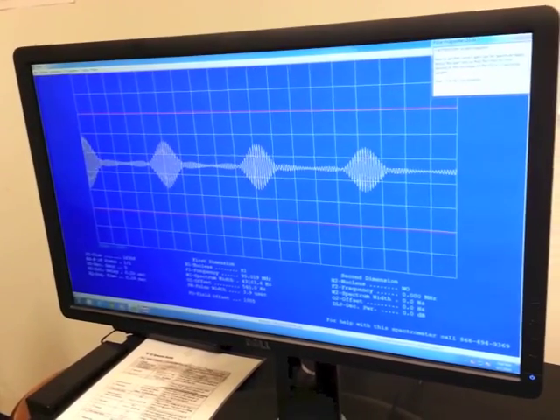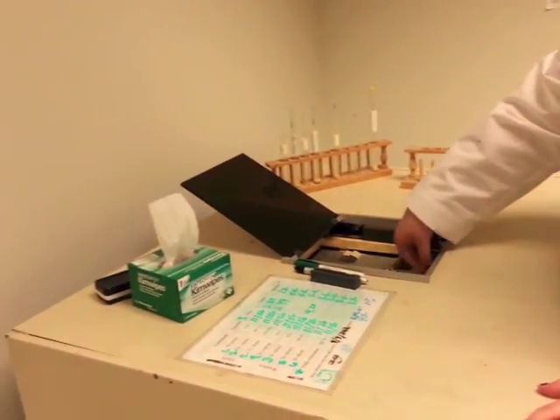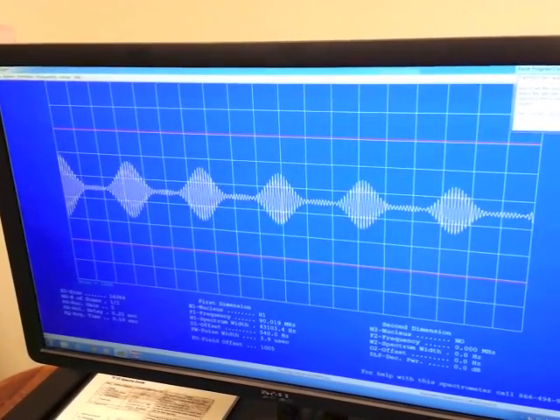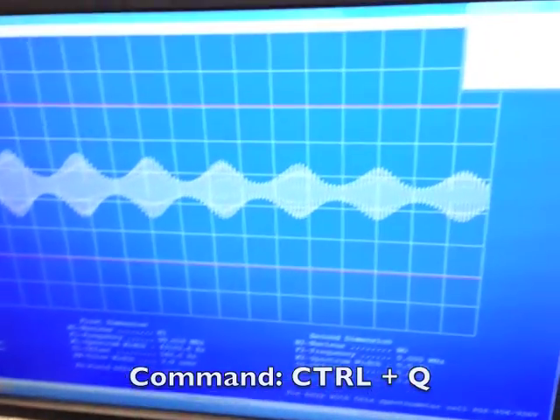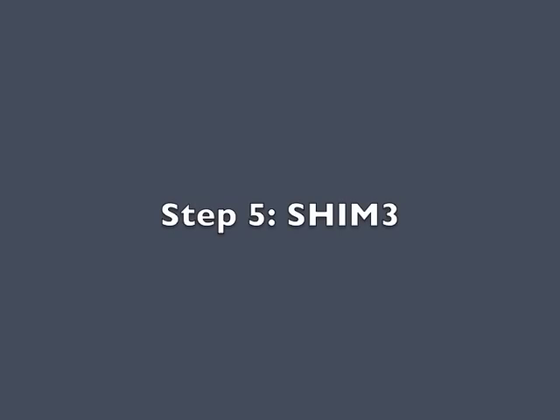After about 20 minutes, the machine will prompt you again to change the spin rate so there are two boxes between peaks. Once there are two boxes between each peak, come back over to the computer and press Ctrl-Q.